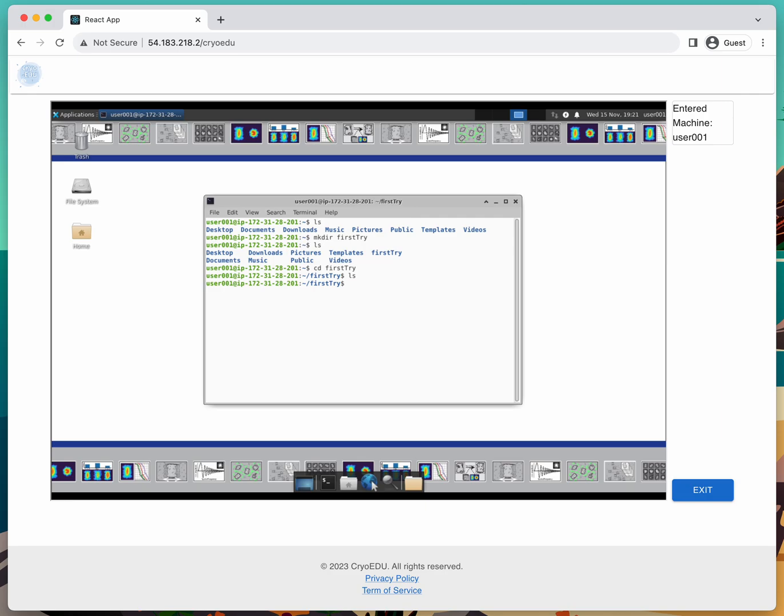We need to do one initialization step before we get started. We're going to be symbolically linking some data into this directory. So symbolic linking, you can think of it as an alias on a computer where it's not going to move the data, but it will point to the data. So the command is ln space -s. And now the path is going to be this specific path.